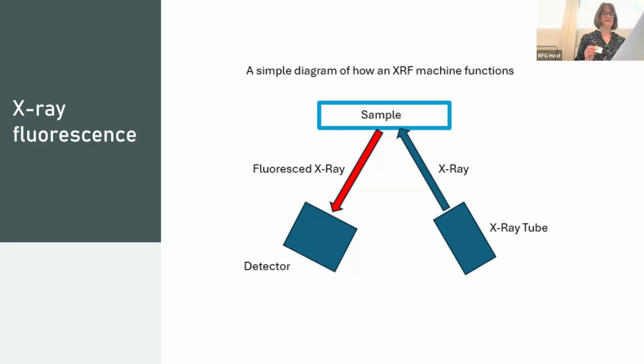As each element gives off its own unique signature, it's then relatively simple to see what we have going on in the sample. This is a useful technique to identify major and minor elements quickly and non-destructively. A key limitation to this technique is that it often cannot detect trace elements and light elements, such as sodium or magnesium, which can be slightly problematic when dealing with glass analysis.